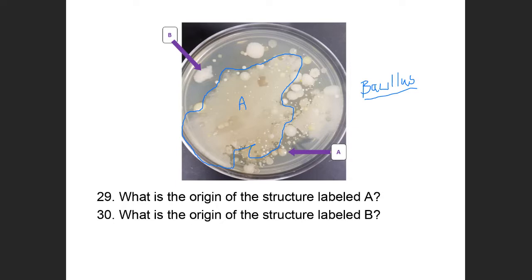Now, when you write this bacillus, and I promise I will not ask about genus and species on the first practical or the second practical, right? But I'm just making note that if you see that, that's genus, where if you see this, then that is just simply a shape. Okay.